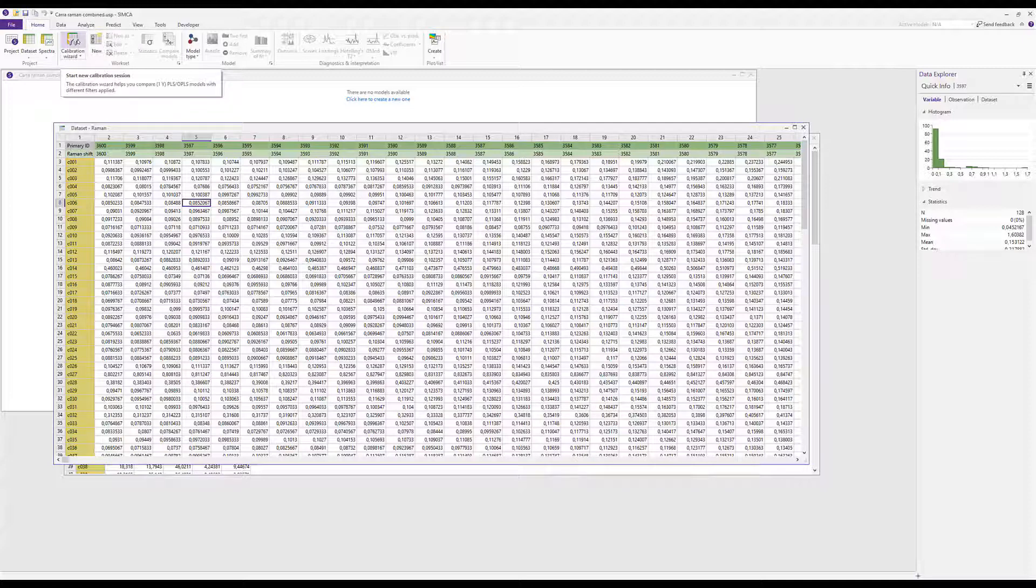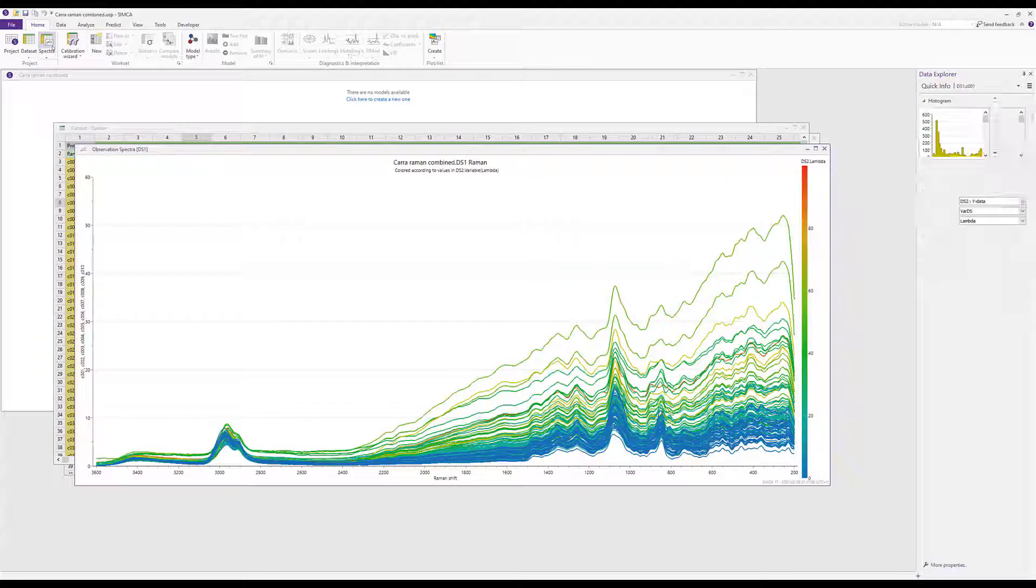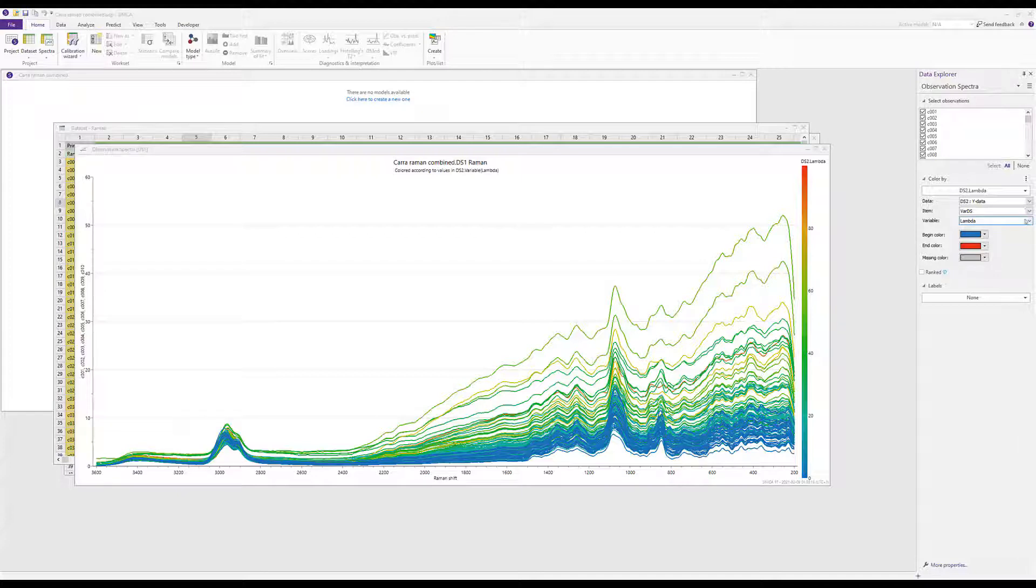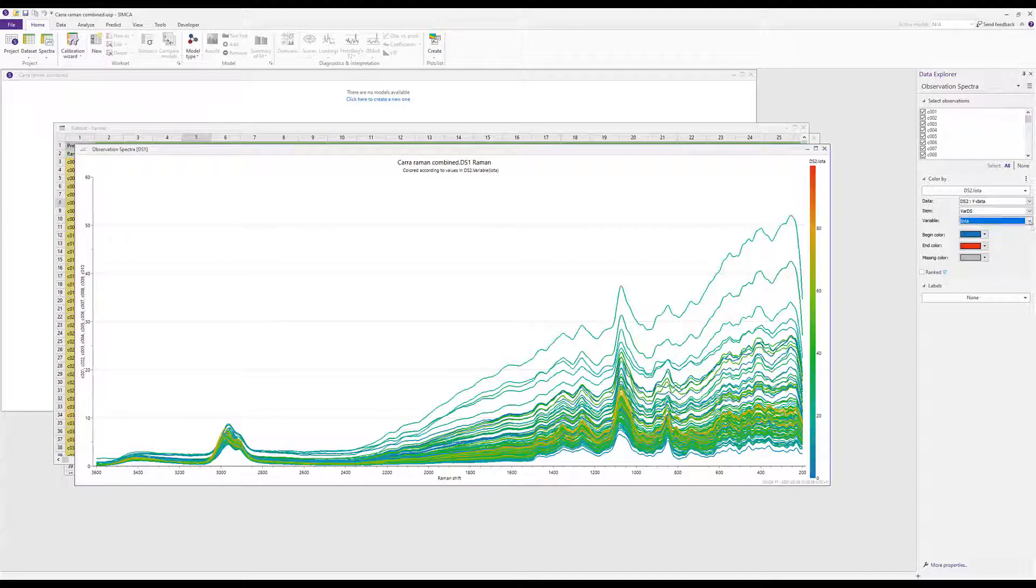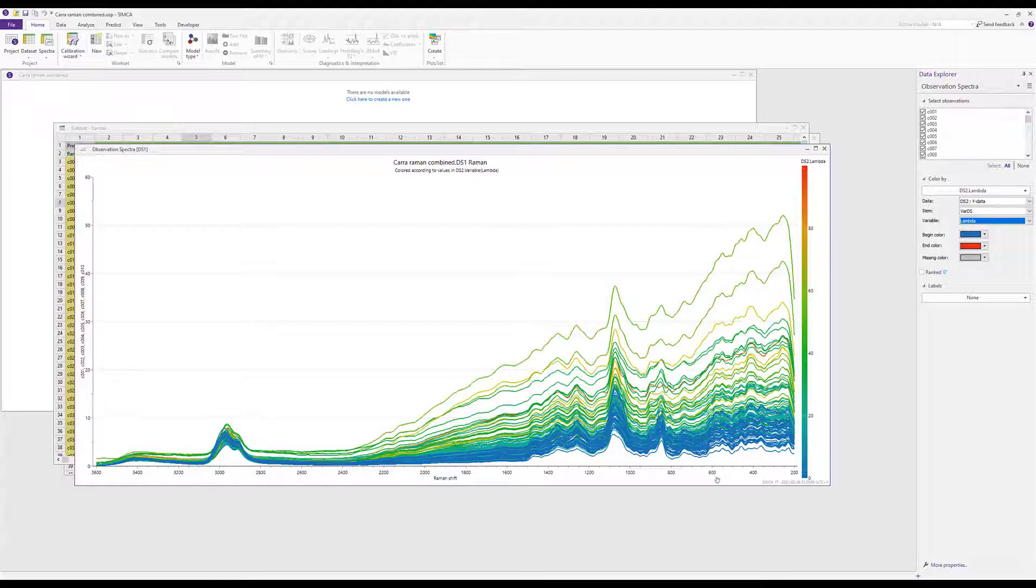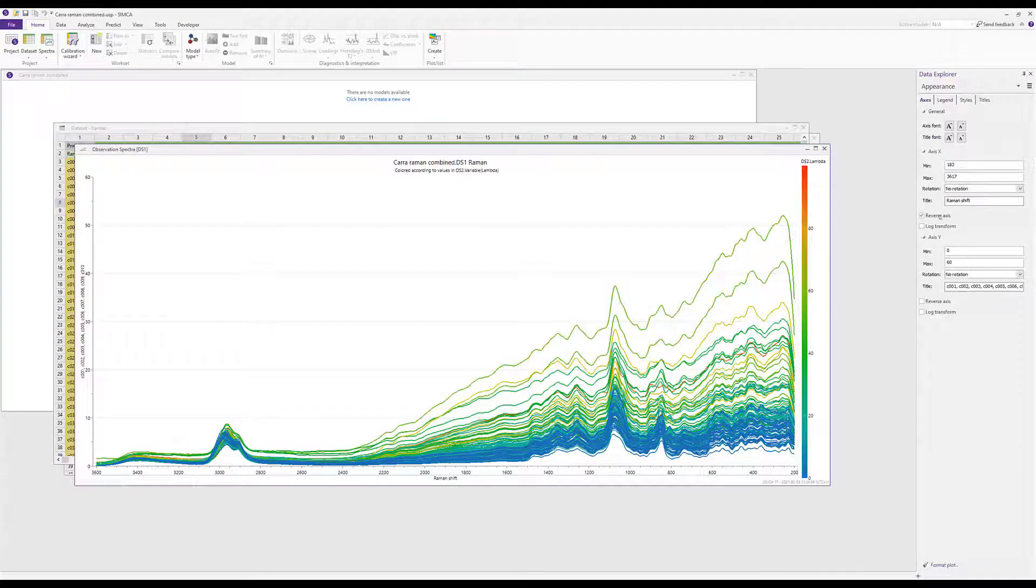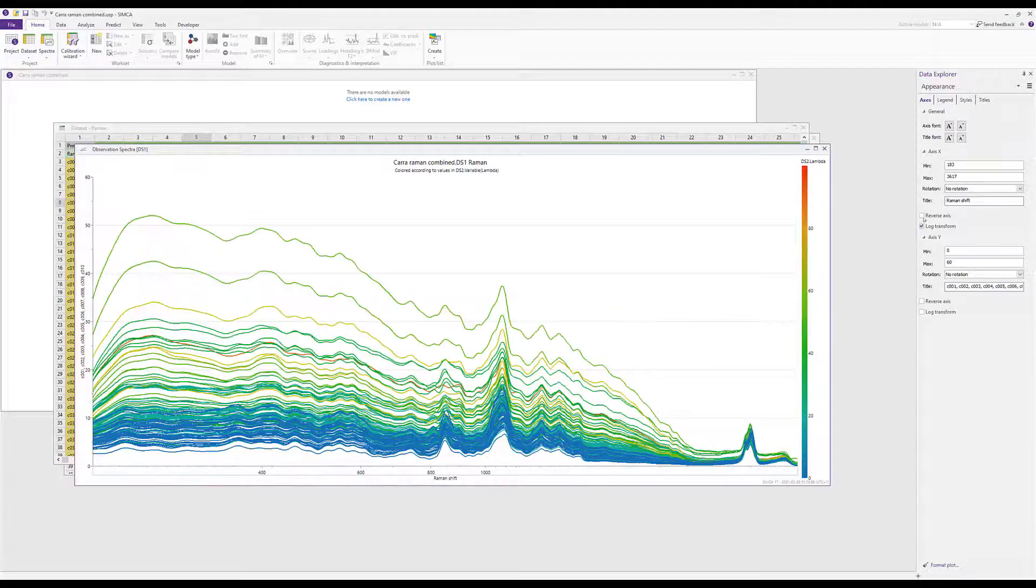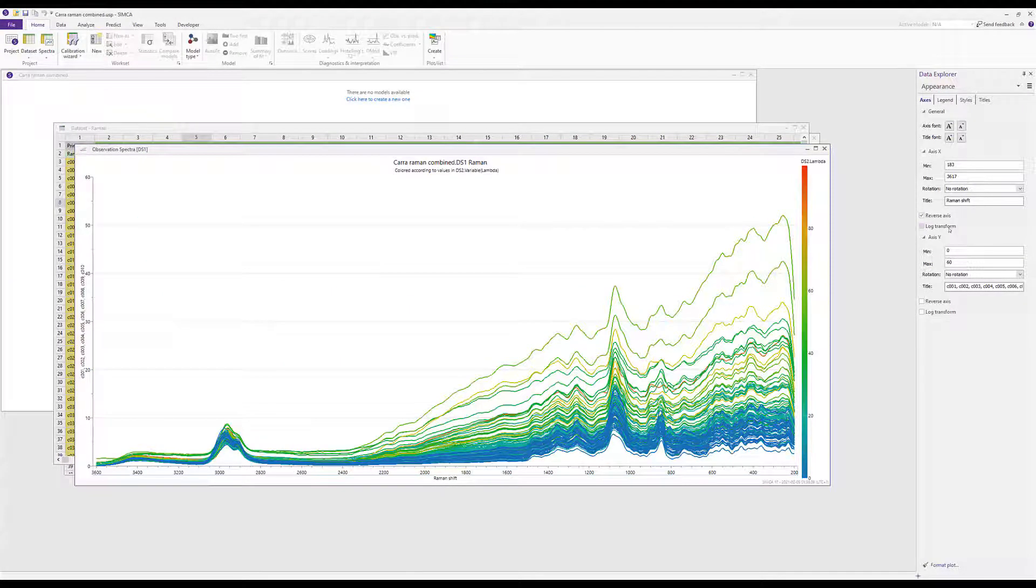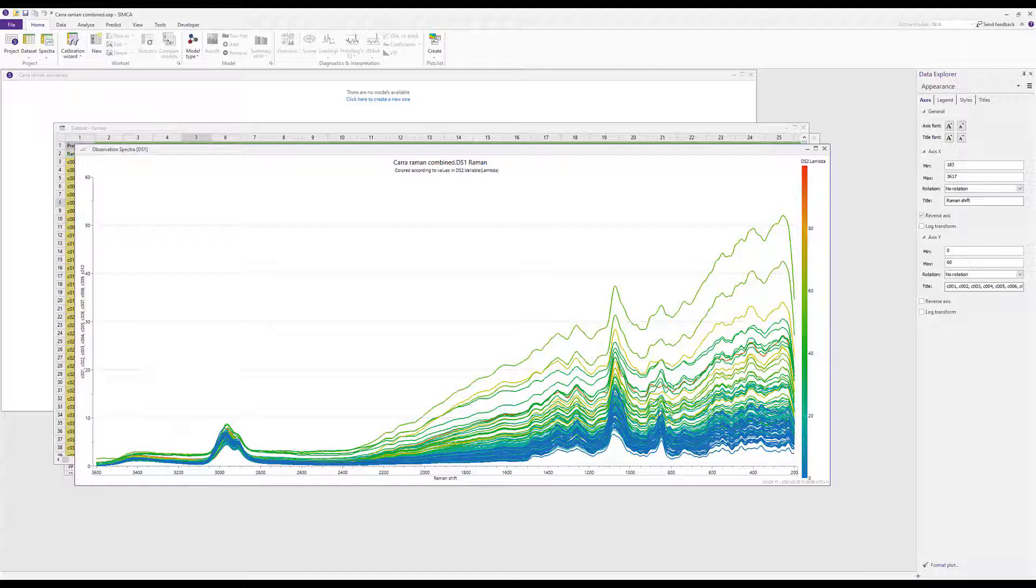In SIMCA 17 we have also modified the spectra plot. By default, the spectra are colored by the first y variable, but this can be controlled easily in the properties pane where you can switch between the different y variables. You can also modify the different axes of the plot. If you click on one of the axes, you can easily access the reverse and the log transform to change the visualization of your plot. More on that plot interactivity can be found in the feature video called Miscellaneous Improvements.